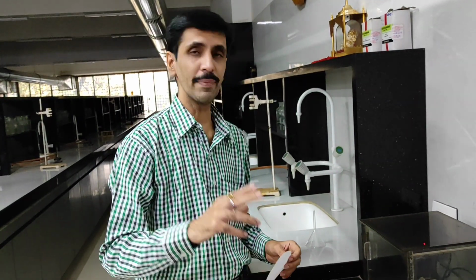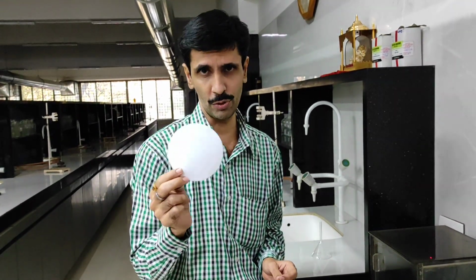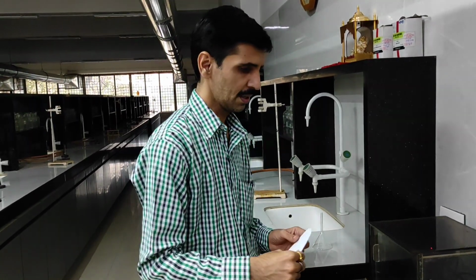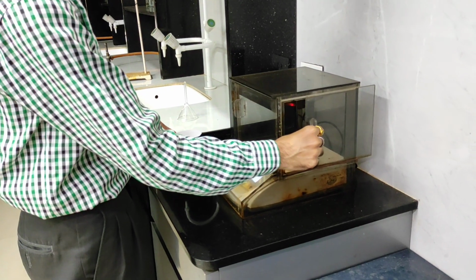Now, my dear friends, in the meantime, while the digestion process is going on, we are going to weigh this Whatman paper 42, as I already told you in the theoretical part. So here we go. The weighing balance, initially it is going to be 0.00.